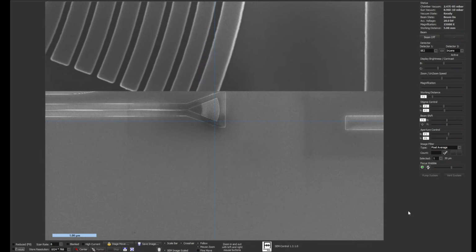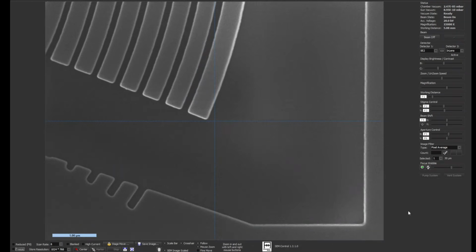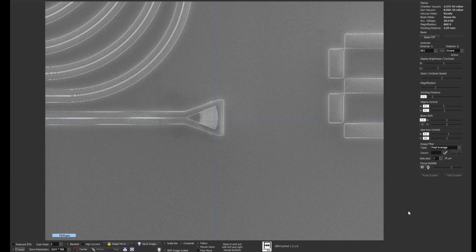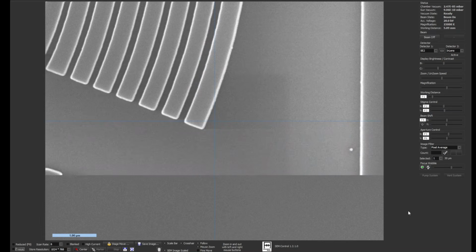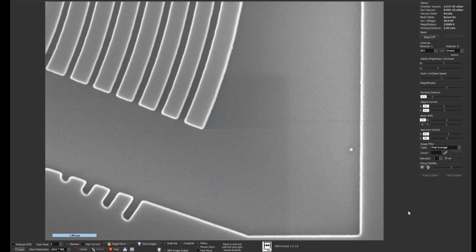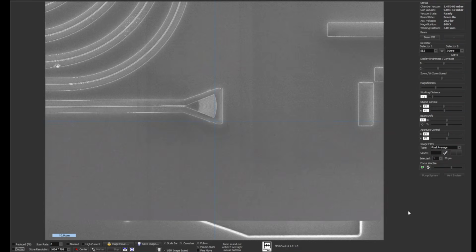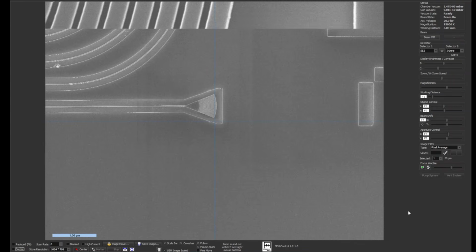It's doing a beam shift calculation. And now you can see we hit the corner very good. Now comes the next position. Here you can already see that we are not at the right location, but then it goes much closer to the area of interest. There's also a small shift always because we use a very large view, and depending on how the features are displayed there, we have some deviation.